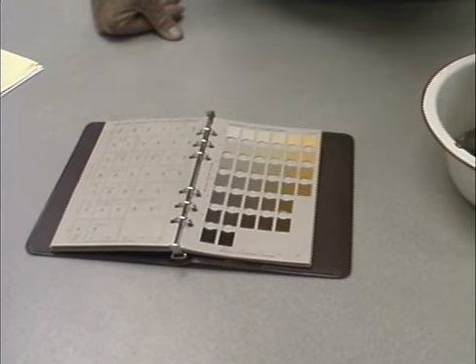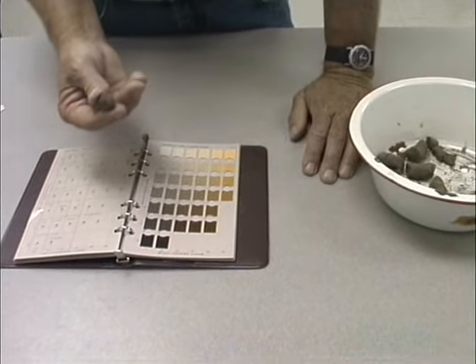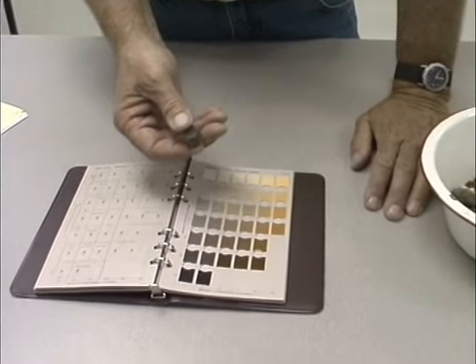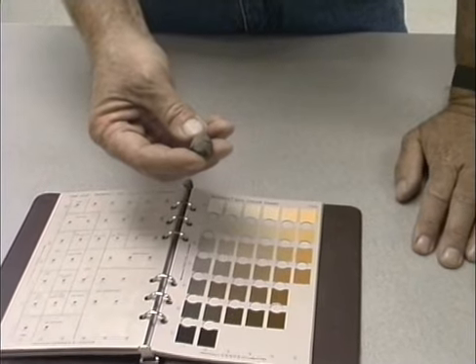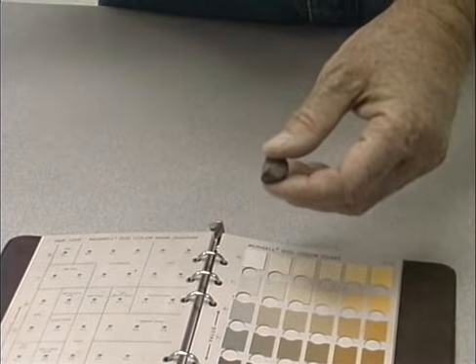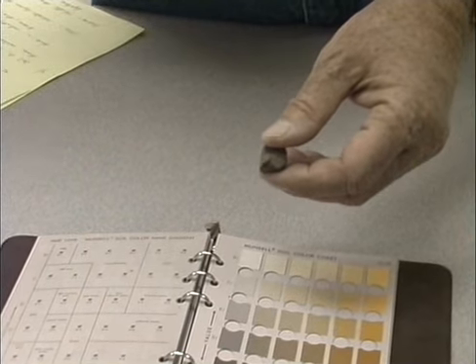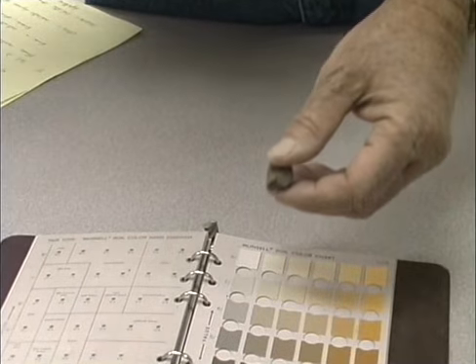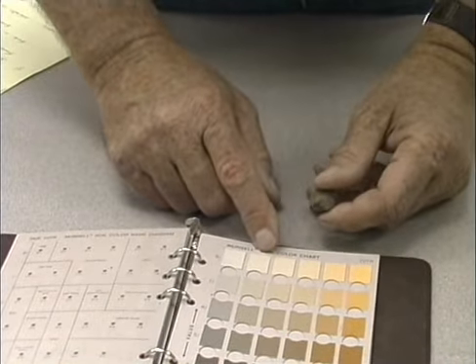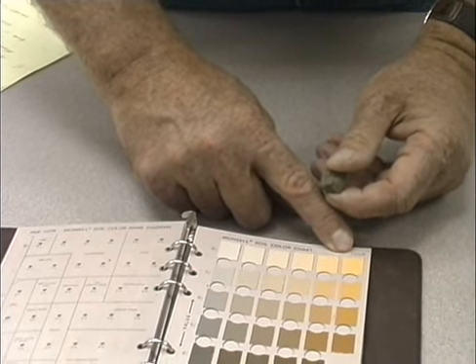The first sample, it doesn't really make any difference what size of ped you use. You want to use one that is appropriate for the chart. This particular soil is fairly dark in color. So the first thing I'm going to try to do is to match up the page that it's on. This particular page is the hue. All soils on this page are hue 10YR.